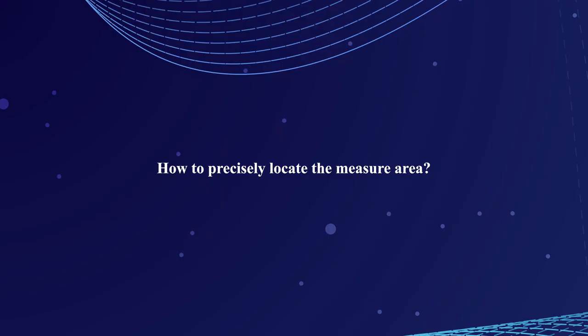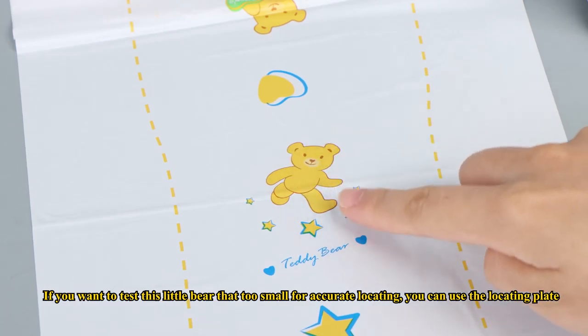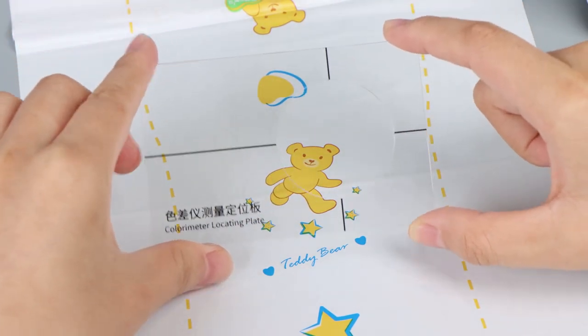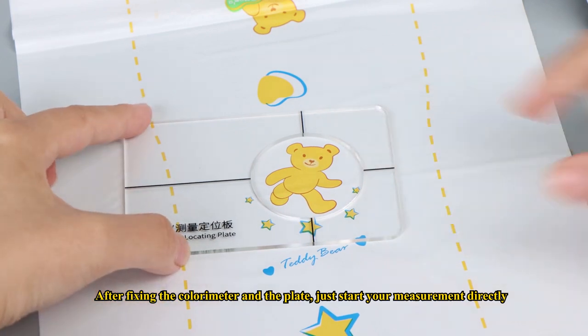How to precisely locate the measurement area? If you want to test a small object — for example, a little bear that is too small for accurate locating — you can use the locating plate. After fixing the colorimeter and the plate, just start your measurement directly.